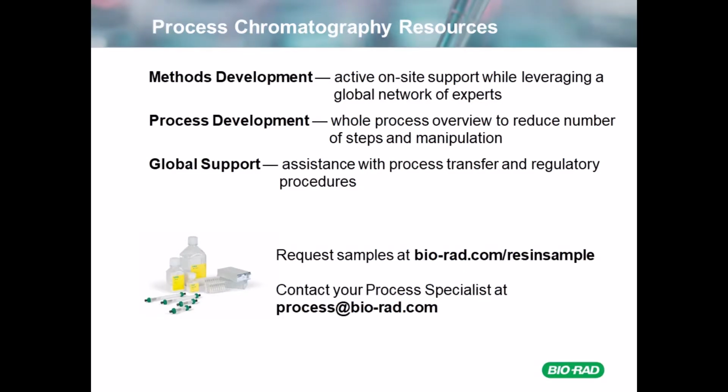Great. So the first question is, how applicable are these design of experiment results to actual viral clearance studies? Based on the results that we saw, the DOE results corroborated very well to when we did the scale-up runs with the pre-pack columns. So I think if you're able to do these DOEs, you can do them with a small amount of sample. You might not necessarily need to check as many conditions, but I do think it will help you feel comfortable that when you do your actual packed column runs, you're going to get the viral clearance that you're expecting.